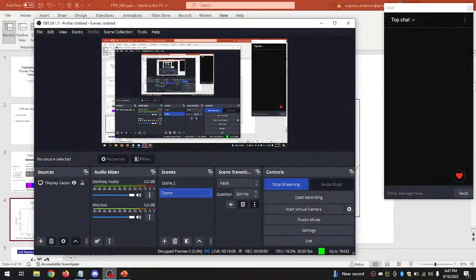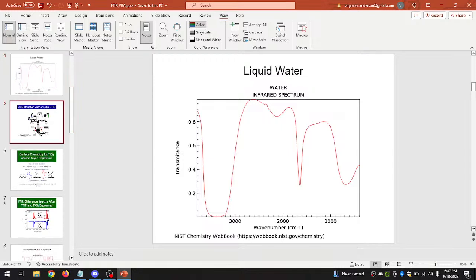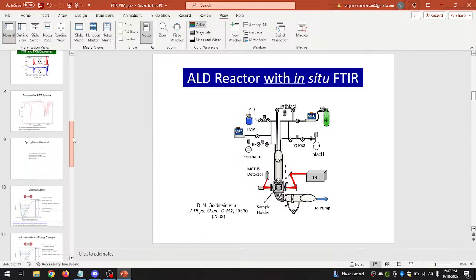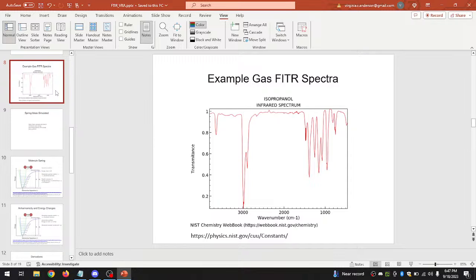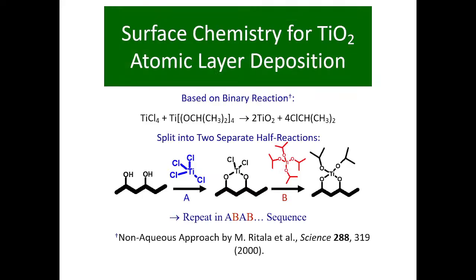Back to the slides. I think that I will skip over atomic layer deposition today and probably have to edit the title. But I want to give an example of a gas spectrum. This is infrared.